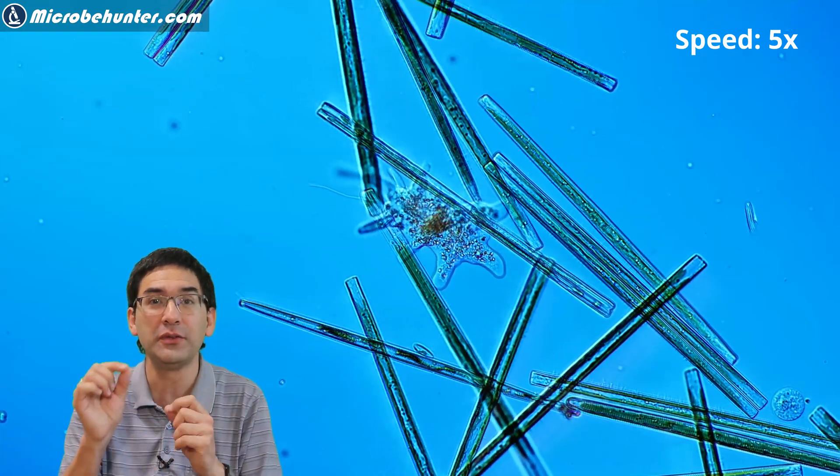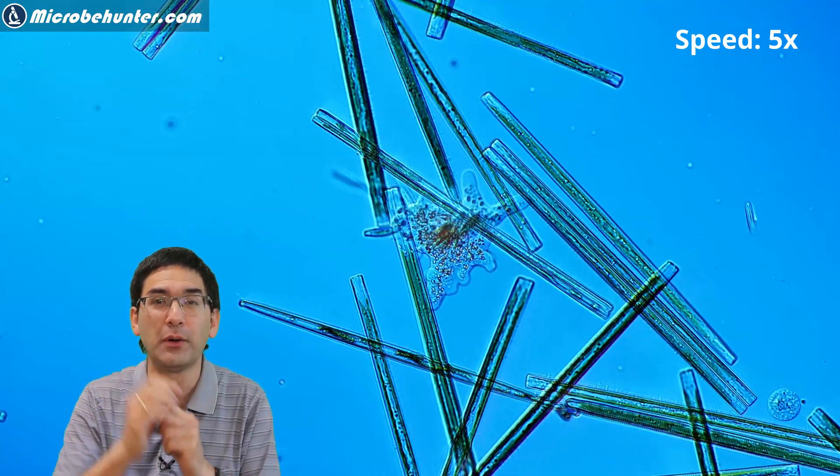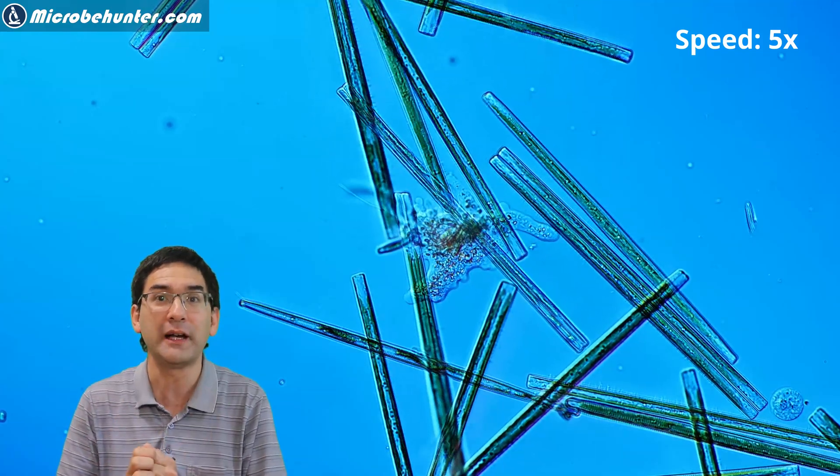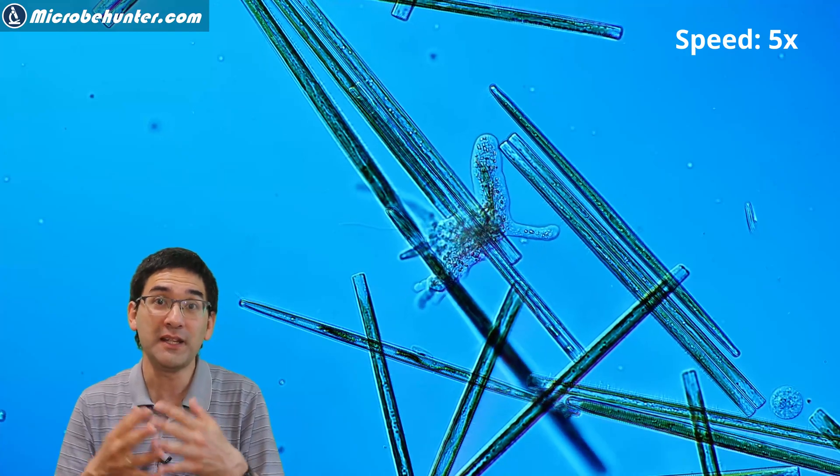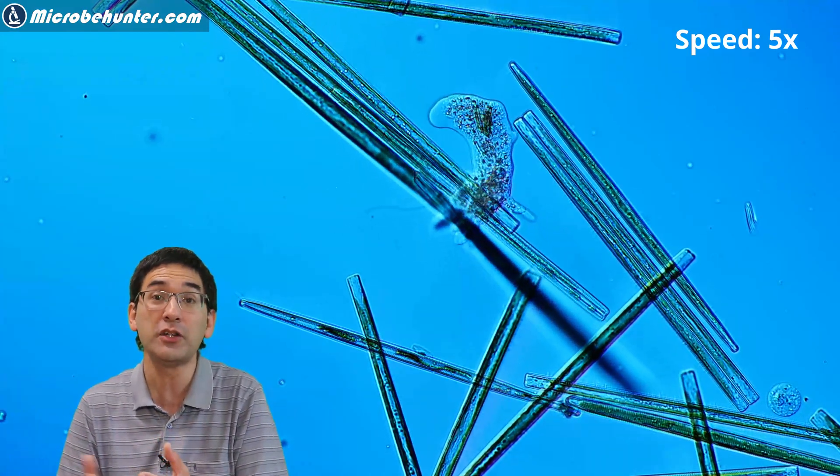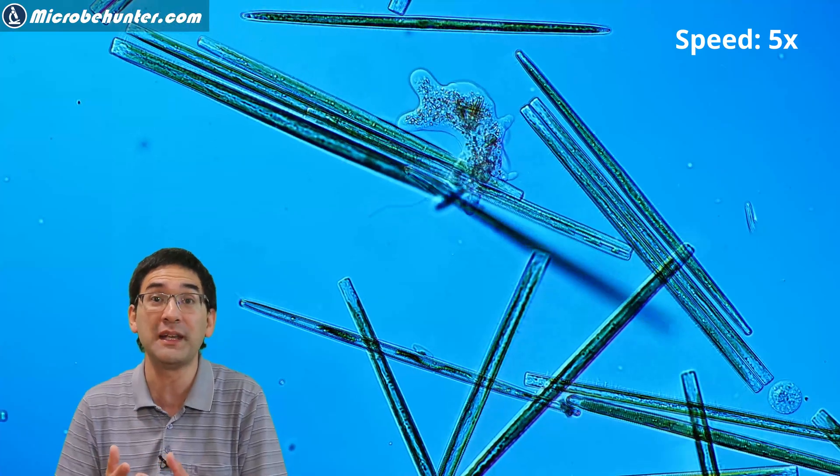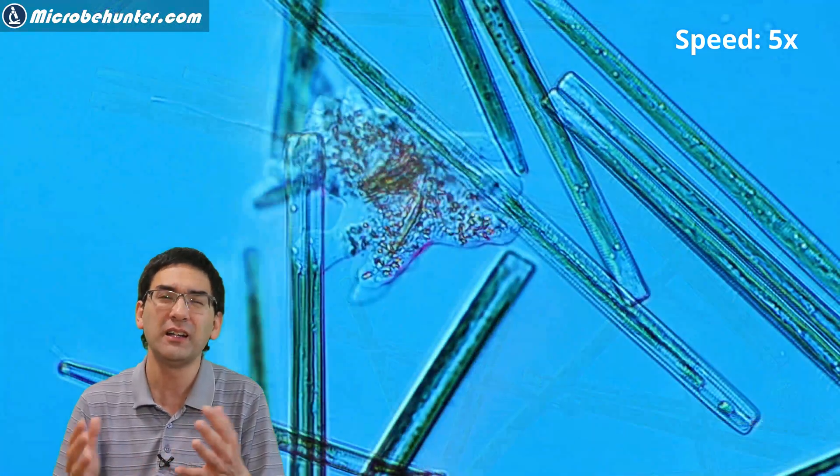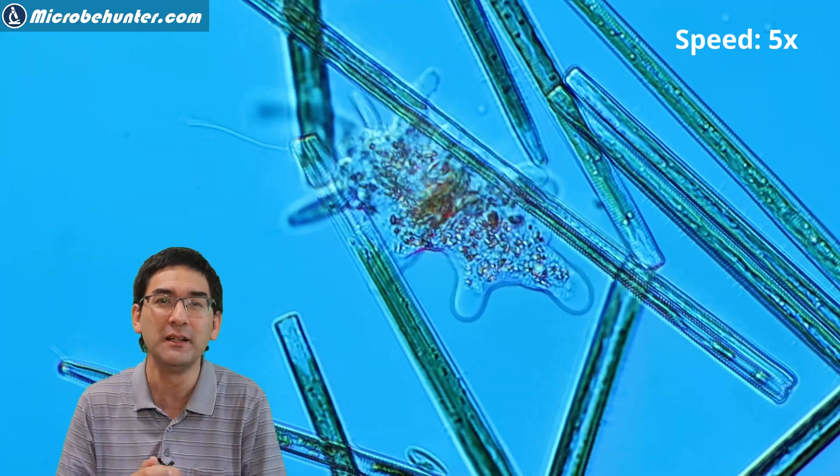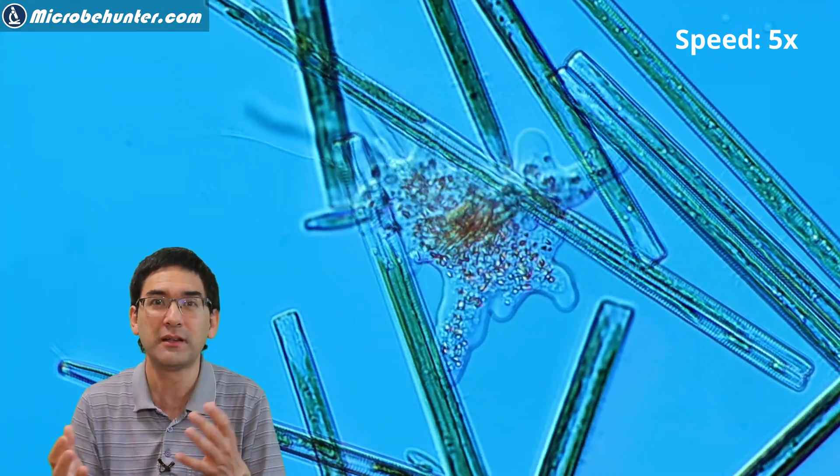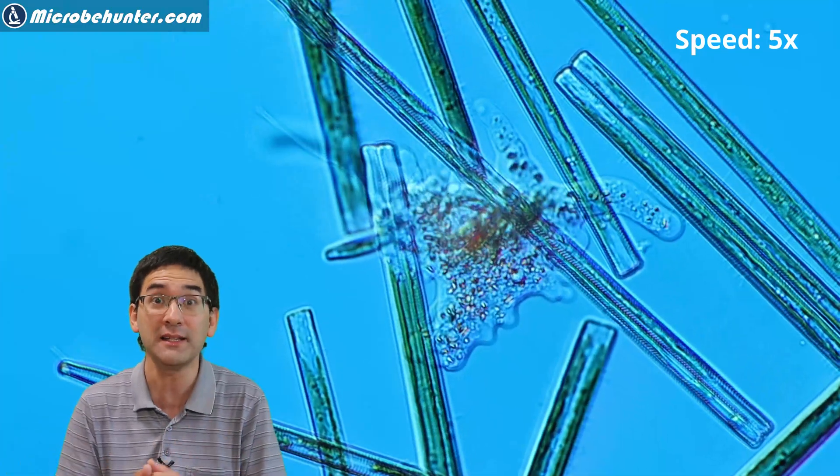If you look very carefully into the cell, you're going to see that there are some green parts in there as well. These are smaller diatoms that were engulfed by the amoeba. What I saw is that some of those amoeba actually also expelled those diatoms again because the diatoms are a little bit difficult to digest. They have a cell wall made of silica, which is very indigestible. Silica is actually chemically related to glass.